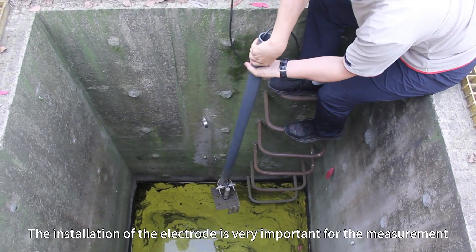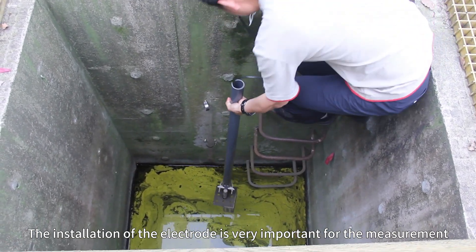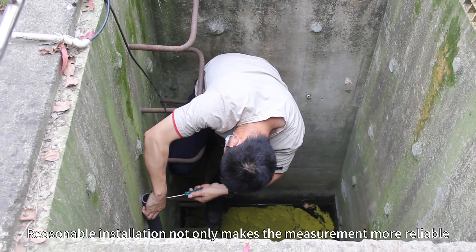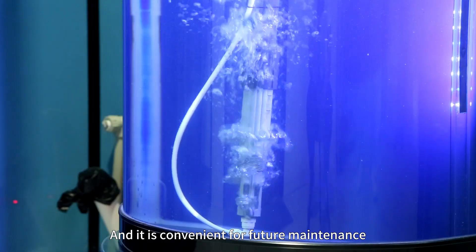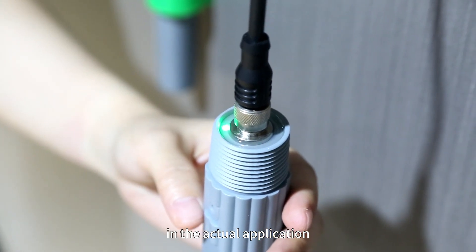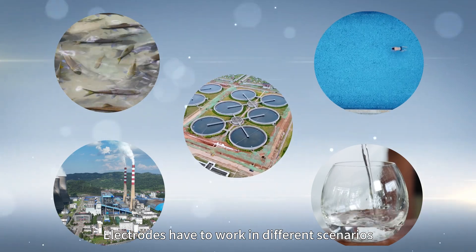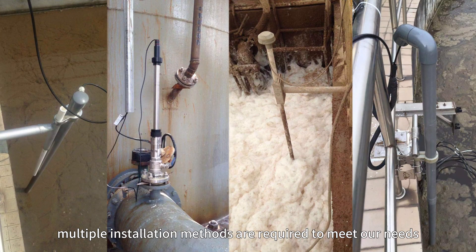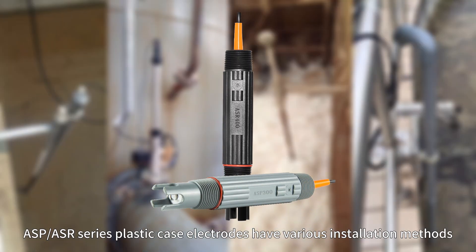The installation of the electrode is very important for the measurement. Reasonable installation not only makes the measurement more reliable and convenient for future maintenance. In actual applications, electrodes have to work in different scenarios, so multiple installation methods are required to meet our needs. ASP or ASR series plastic case electrodes have various installation methods.